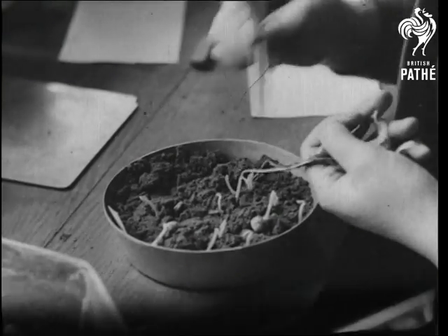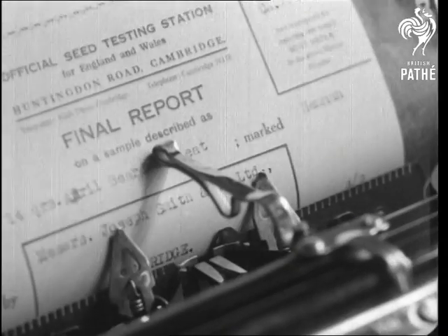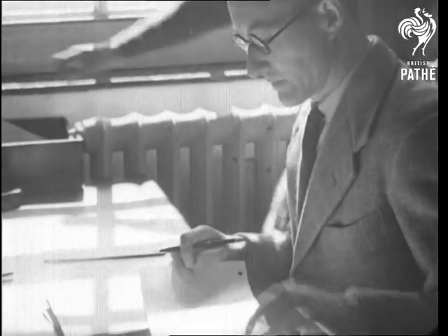And so to the final report on both tests, for purity and germination. These details are of vital importance to farmers, to those of us who run a kitchen garden, and in fact to all who eat.